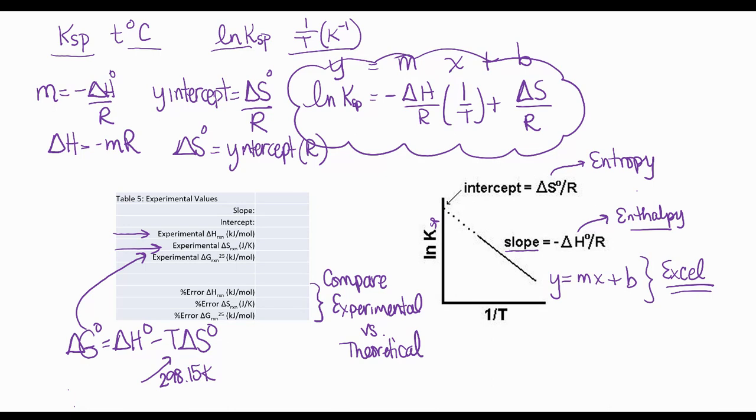Okay, so that's a lot of information, and that's why I recommended that you did your reading on it first, especially 17.1 through 17.4, but you do have 2 weeks to do this. So you can do your reading, come back and re-listen to this, and then go ahead and try to tackle the data. All of it should be in the Excel files, the easiest thing. Put all your calculations in there. Any questions you can type in there. And then you'll generate the two graphs, one for the solubility of the salt, and the other one is this one, ln KSP versus 1 over T.